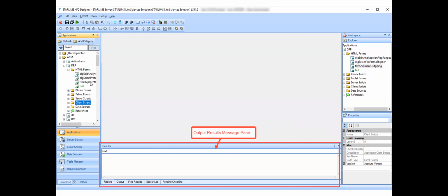When you click the Pending Check-ins tab and hit the refresh button on there, you will see all of the objects that are checked out currently for you, and you have an optional button that will show all objects that are currently checked out by anybody. So there are times when you're going to be in a system and you're working with multiple developers, and it shows up that you need to come up here and edit something that all of a sudden shows up as a red item in this list, and you know that someone else has it checked out. You'll go down to this pending check-ins, do a refresh with all users selected, and you'll see the name of the person that has it checked out. You'll be able to give them a phone call.